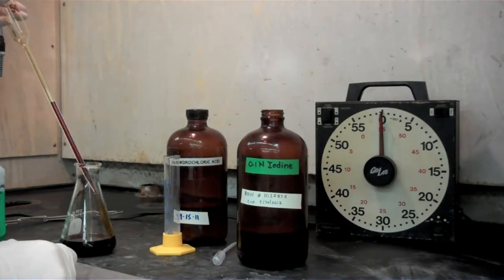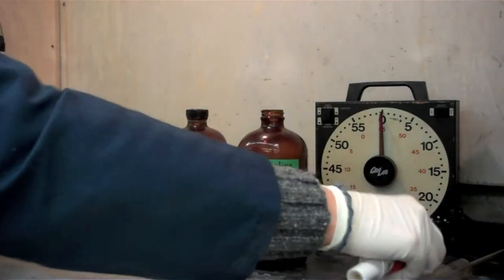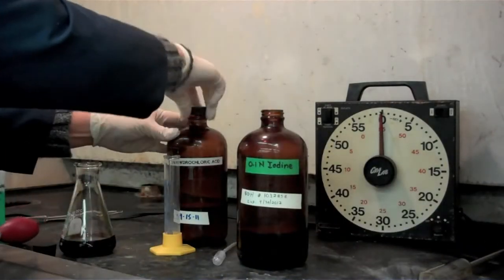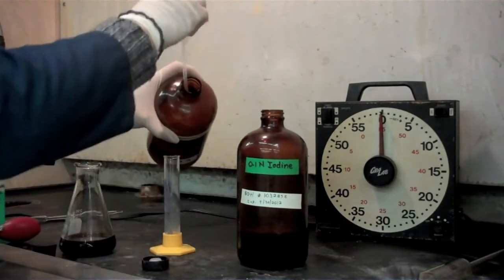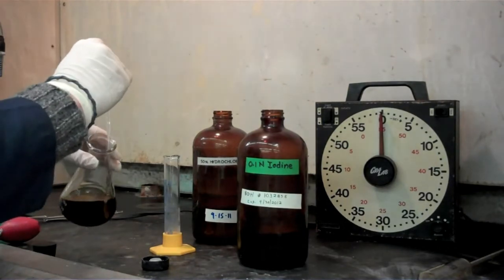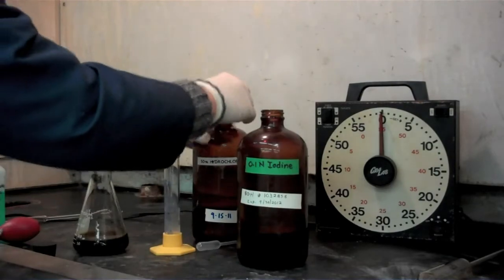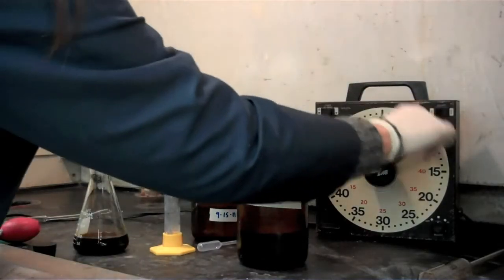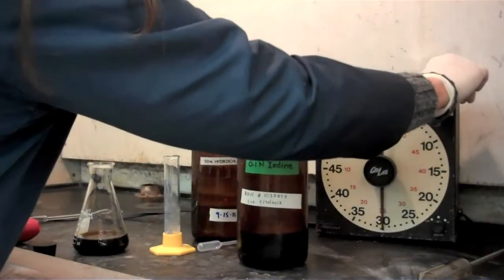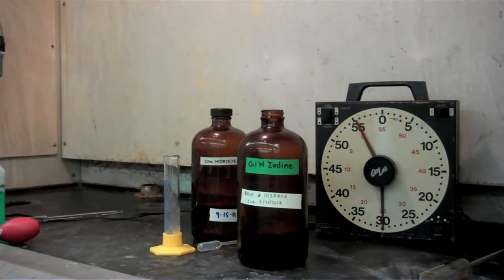So again, we're going to tap the end of the pipette to draw off all of the iodine. And then it is good technique to wash down any iodine residue that's remaining on the wall of the flask with a little bit of the 50% hydrochloric acid. And now what we're going to do is set our timer for 30 minutes and stopper our flask and store it in the dark until our buzzer goes off.